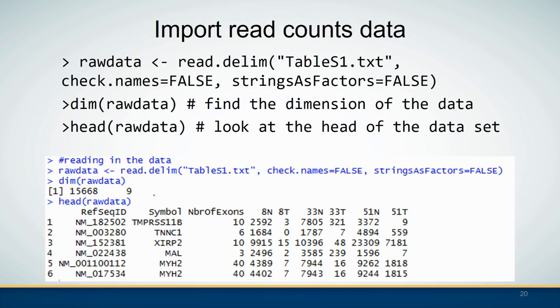I will show you how to use edgeR with an example of RNA-seq of oral carcinomas versus matched normal tissues — this example is provided by edgeR. The read.delim() function can import the text file of read count data. The dim() function returns the dimensions of the dataset including the number of rows and columns. The head() function lets you look at the first several rows of the dataset.